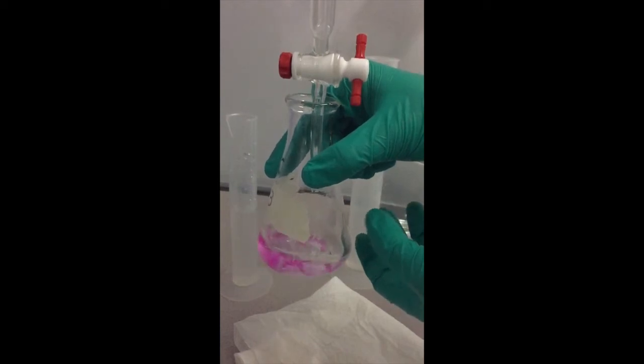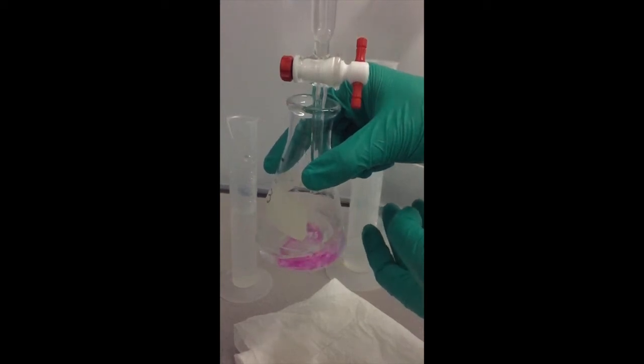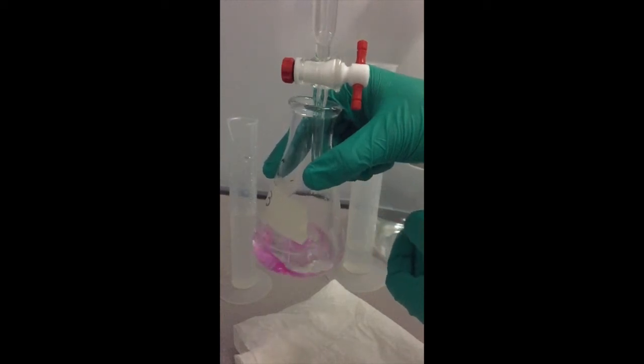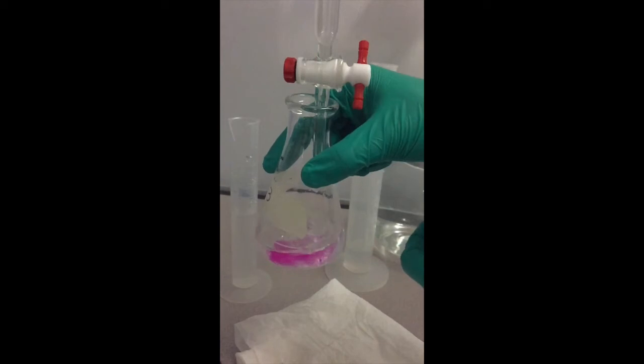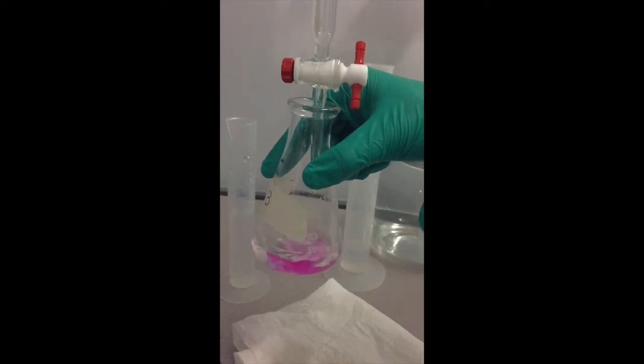After carefully obtaining the necessary data from the batch experiment, prepare fresh reagents in order to run the CSTR. Before running the experiment, first calibrate the volumetric flow rates of the pumps. This can be done by running the pumps at different speeds and obtaining a sample for a specified time. Next, set the temperature of the heater to the appropriate temperature, just like in the batch reaction, and fill both tanks sufficiently with fresh reagents so that no air will be let in the pumps.